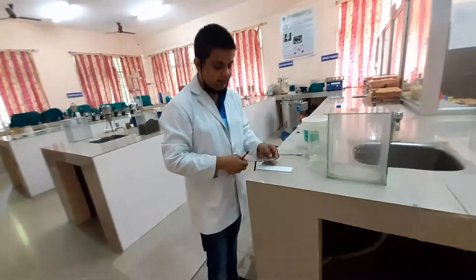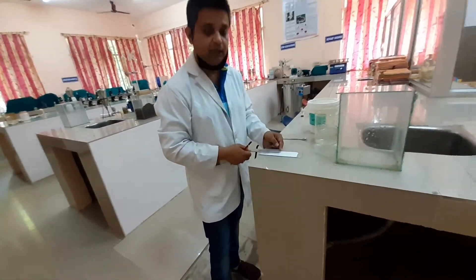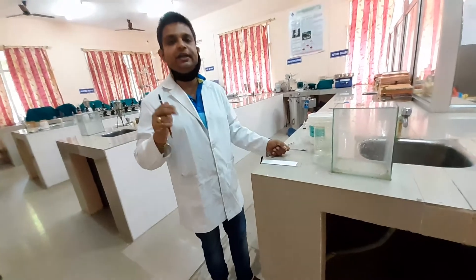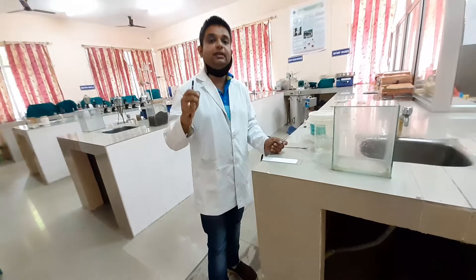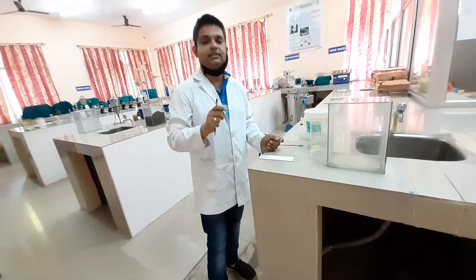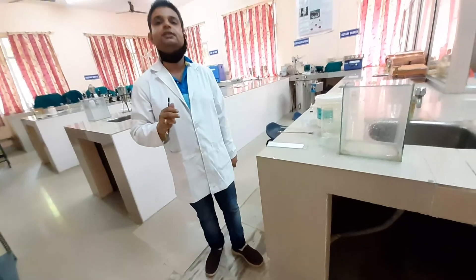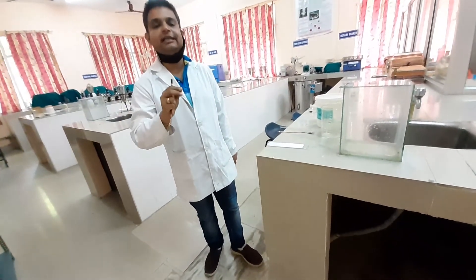Similarly, for the test sample, measure the distance traveled by the solute front. Suppose it travels 6.1 centimetres — so 6.1 divided by 10 equals 0.61. The RF value of the caffeine present in your test compound is 0.61. From that, you report that the distance traveled by the caffeine present in the tea extract gives an RF of 0.61, which matches with the standard caffeine.